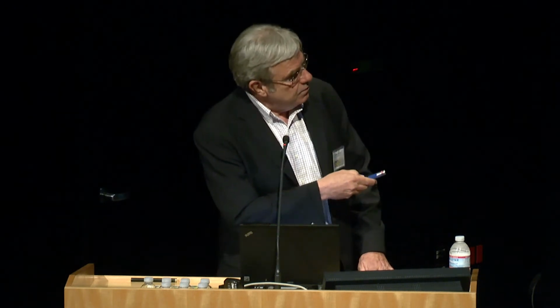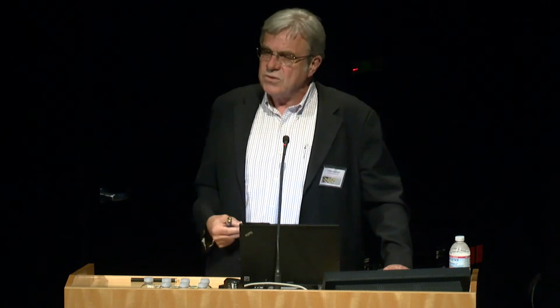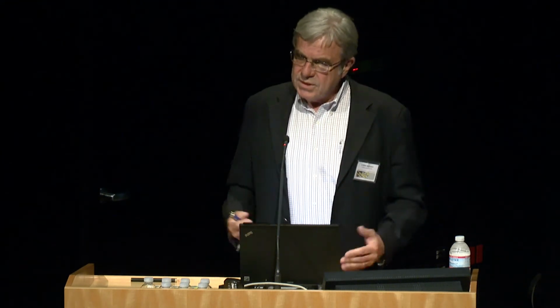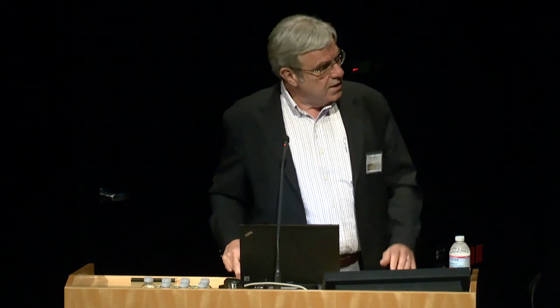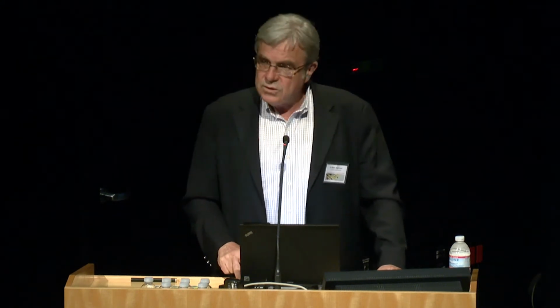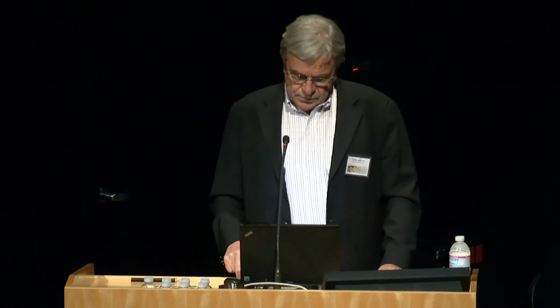So this, what you might have at first thought of as an interference, is actually a very interesting signal because it's telling you not about neurotransmission, but rather about metabolism and ongoing processes that are occurring there. So I'm going to focus on the dopamine today, but that signal you'll keep seeing cropping up in the examples that I show you.